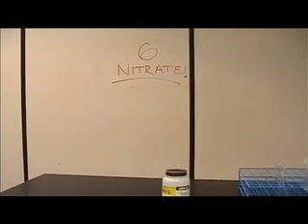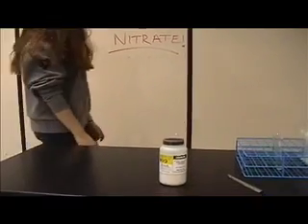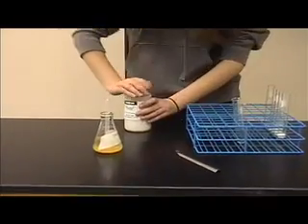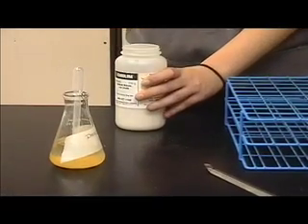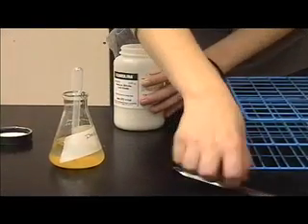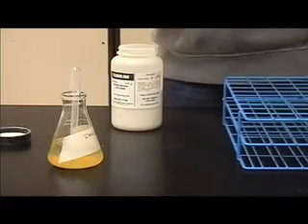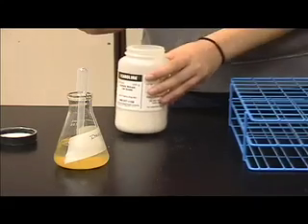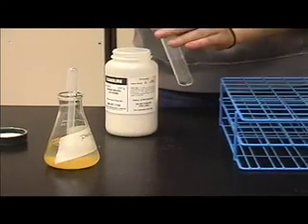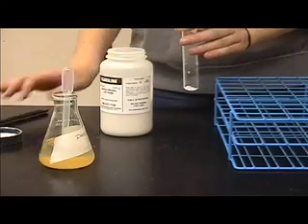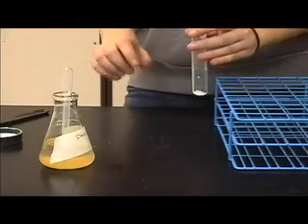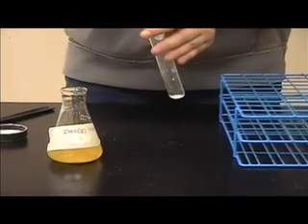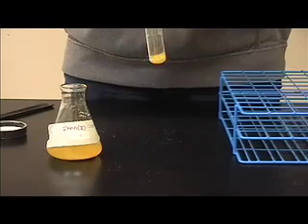So our last anion today is going to be nitrate. Now, this test is a little bit dangerous, so just take some precaution. Here's our nitrate. We're going to be getting clean scoopula, just scoop a little bit of the nitrate out of the container, just a little bit. Sometimes it's going to be a little hard to get. Just take a little bit. I'm going to put that aside. And we're going to use iron 2 with sulfate, just put a few drops. It's a slowly yellow color. Just put a few drops in there.